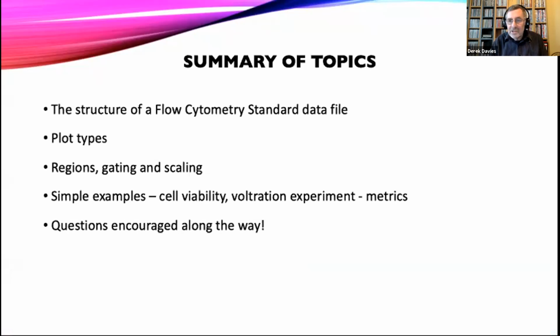I might say this several times, but this is not going to be a FlowJo tutorial, and FlowJo isn't the only analysis software out there. In fact, in our next session, we will probably be using FCS Express to do this, and it doesn't matter which cytometric analysis program you're going to use. 95% plus of the time, they will do exactly the same thing, and certainly everything we're going to look at today, they will be capable of.